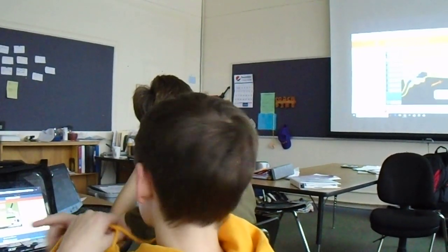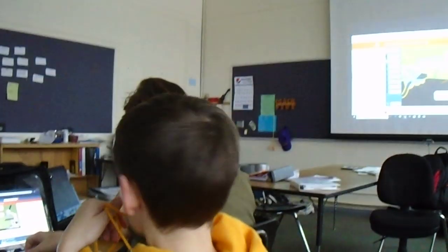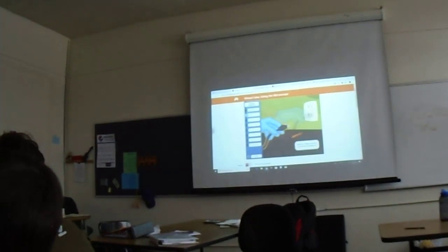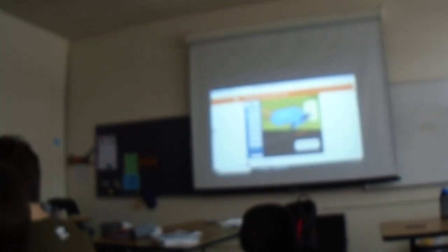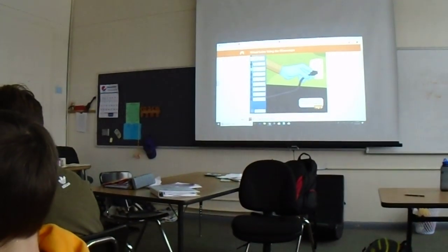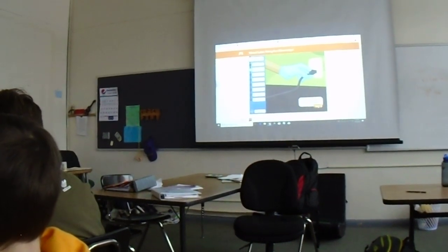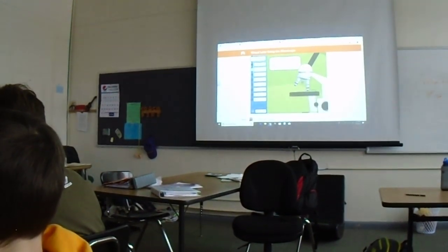We're going to click next. Start by making sure the microscope is plugged in. So, the first thing we want to do is plug our microscope in. Since this is a virtual lab, we can do that. We're going to plug our microscope in. Click next.